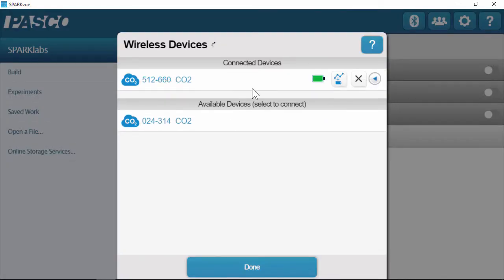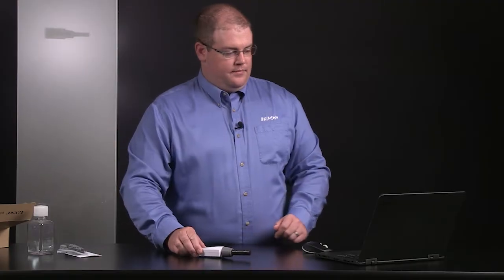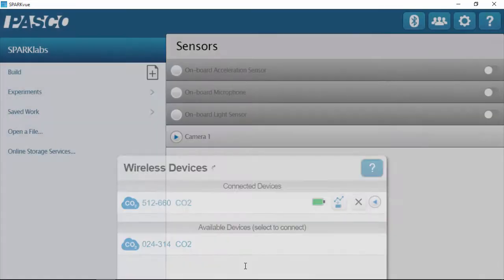Once it's connected, you'll see it move into connected devices within the software, and the Bluetooth LED is now blinking green, indicating that it's paired. I'll click done to close the menu.